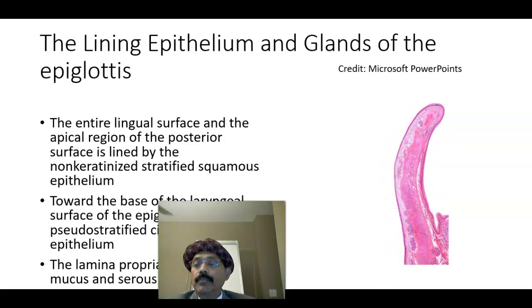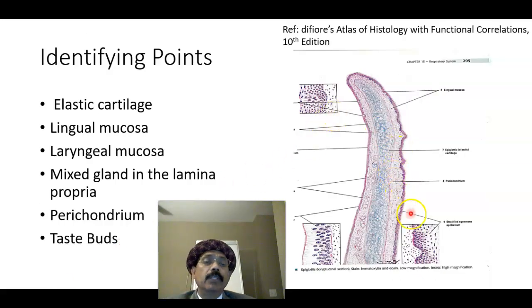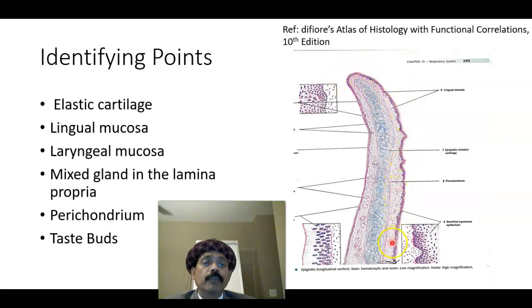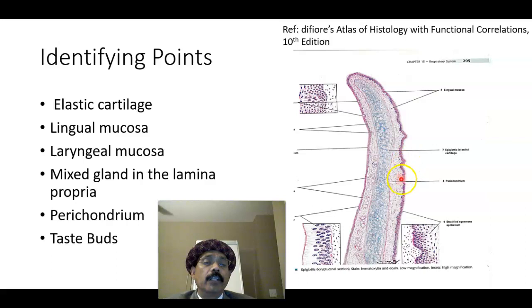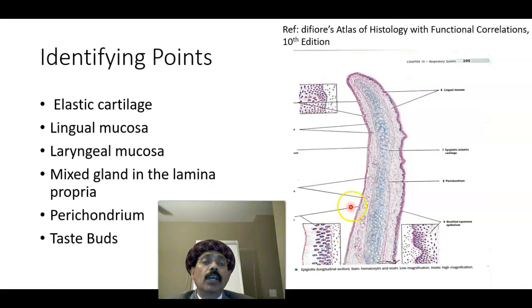Looking at the previous image, the lining epithelium on the lingual surface is stratified squamous epithelium. On the entire lingual surface it is stratified squamous epithelium. In the upper part of the laryngeal surface it is still stratified squamous non-keratinized epithelium. This is also non-keratinized on the lingual surface. The lower part of the laryngeal surface lining epithelium is the pseudostratified ciliated columnar epithelium, also called respiratory epithelium.